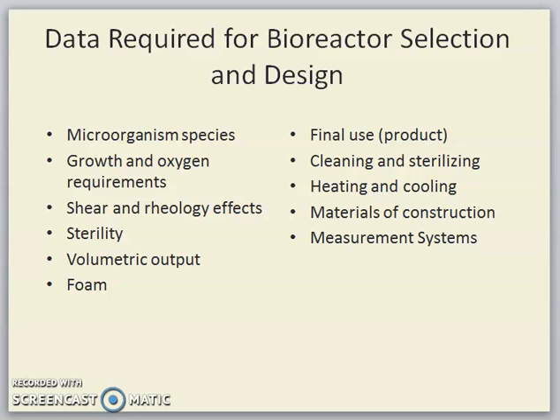And then we need to know the volumetric output, and the foam formation, based on previous studies. We have to do homework on whether there will be foam formation during the fermentation, so that later when we have this production, we can take precautions. And we need to know the final product of our fermentation.